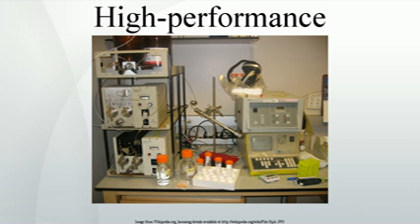The composition of the mobile phase may be kept constant, isocratic elution mode, or varied, gradient elution mode, during the chromatographic analysis. Isocratic elution is typically effective in the separation of sample components that are not very different in their affinity for the stationary phase.